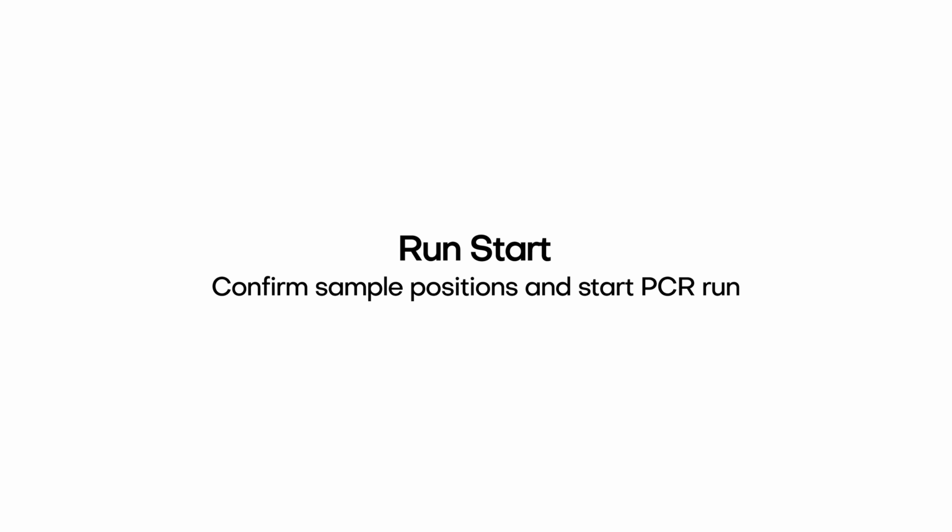Confirm sample positions on the instrument, verify the run parameters, and initiate the real-time PCR run by clicking the Start button.